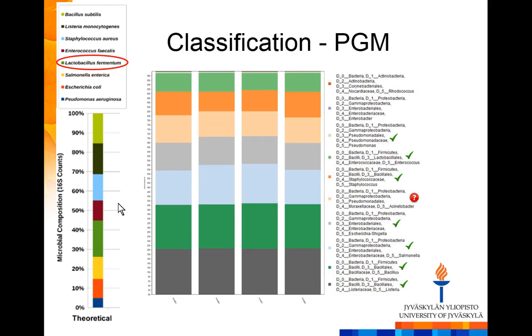And also here we have one genus or one species missing. So this Lactobacillus fermentum was missing.